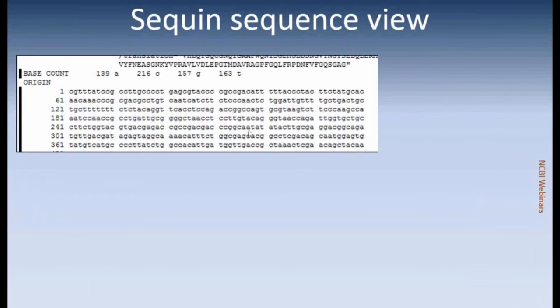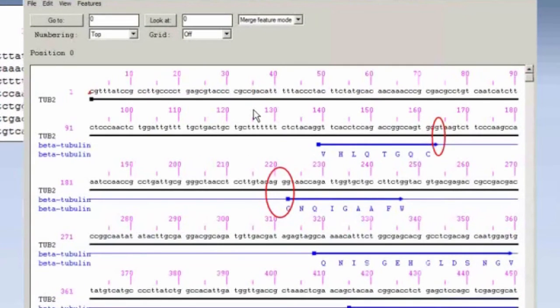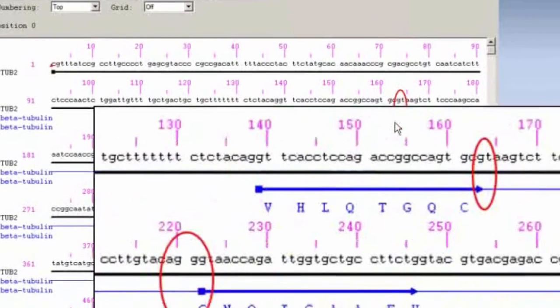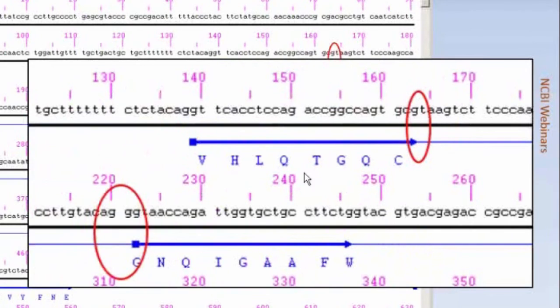One other thing you can do in Sequin is when you are in the record view or the GenBank display format, if you double-click anywhere in the sequence, you will open the view of the sequence. This already has the CDS annotated, and you can then see easier the GT and the AG that is off on this CDS annotation. The fact that there is this little blue arrow means that the CDS is going through this G, and then it is picking up at this G. It is missing the G that is actually the start of the exon. So that is something else you can do in Sequin to see how the feature is annotated on your sequence.